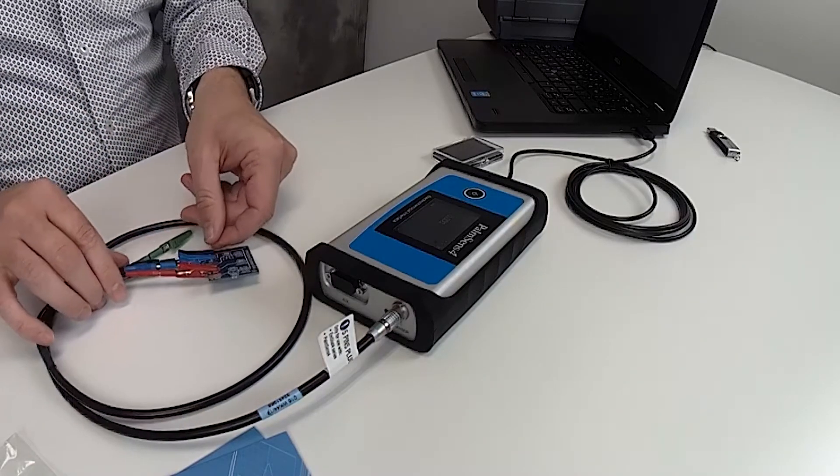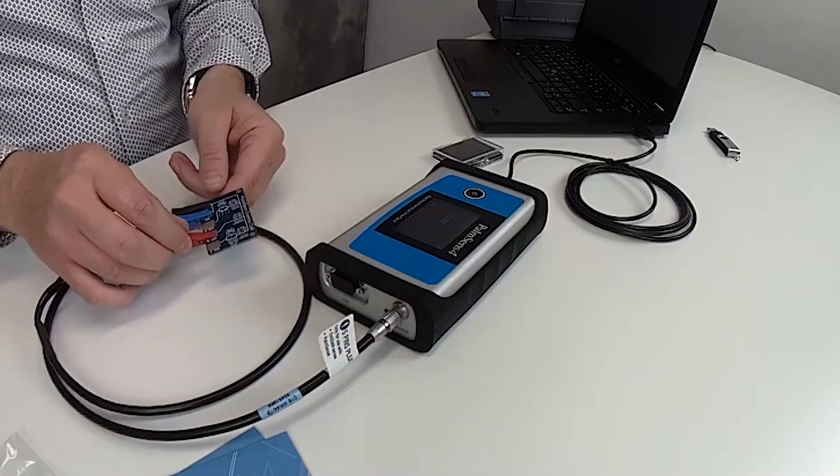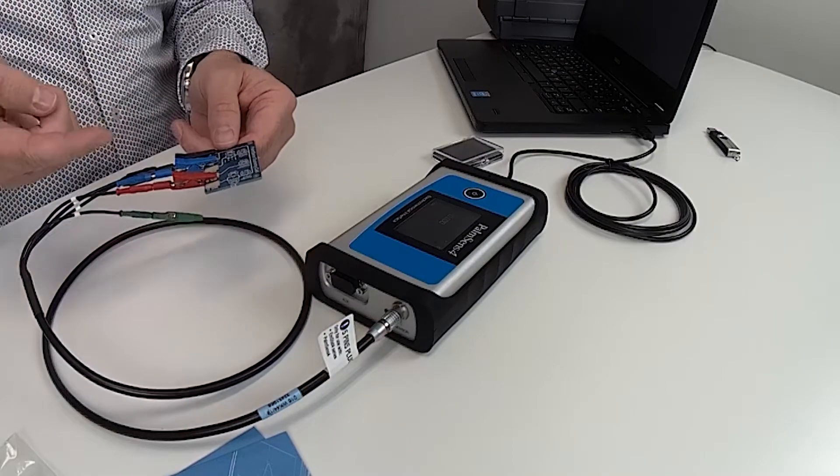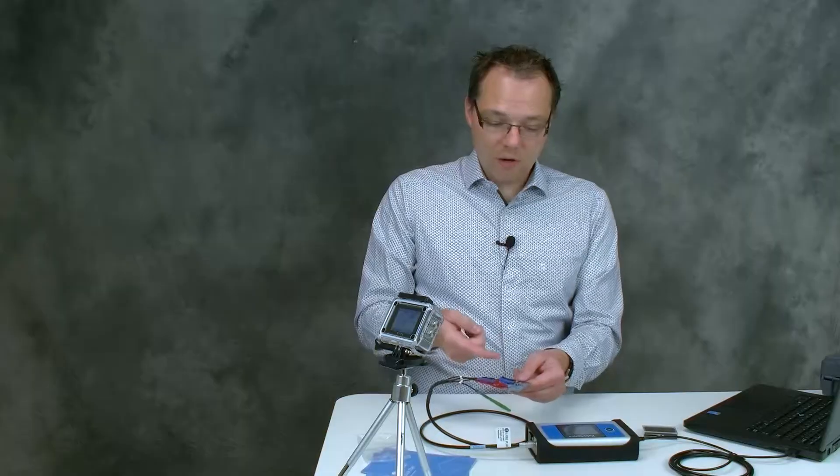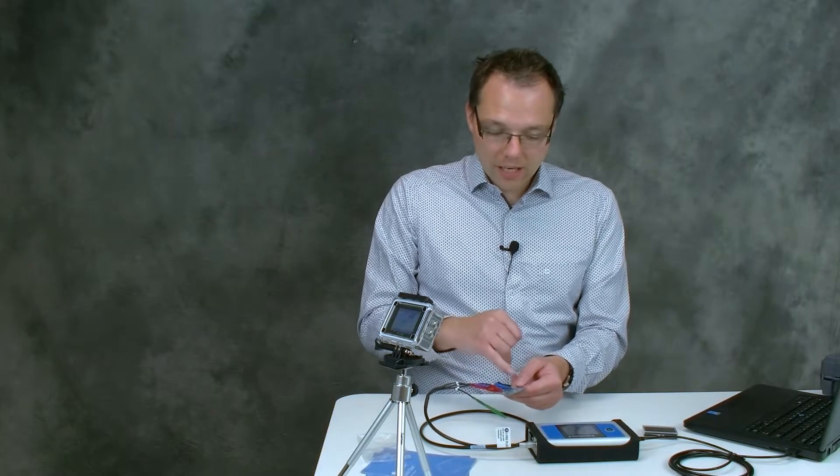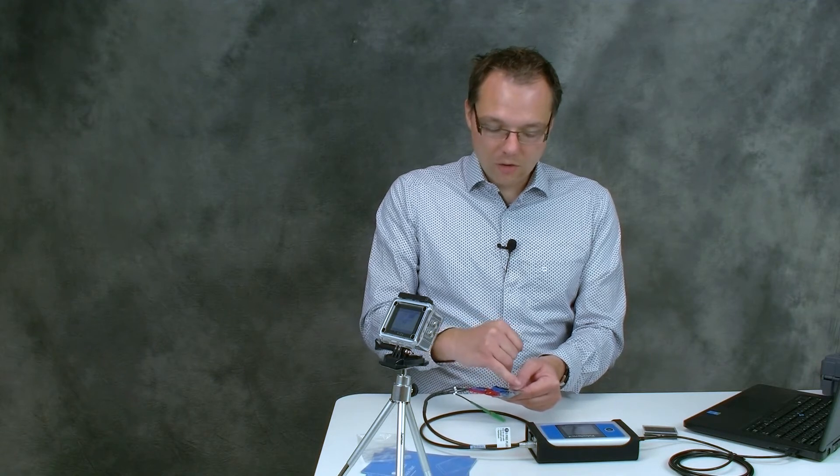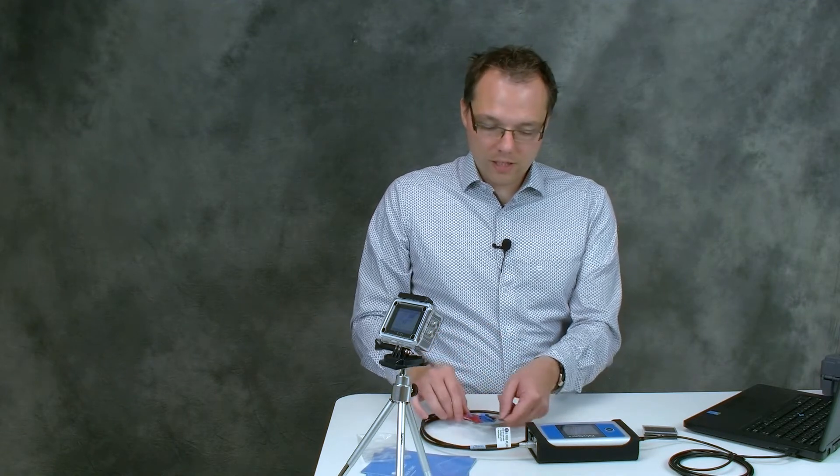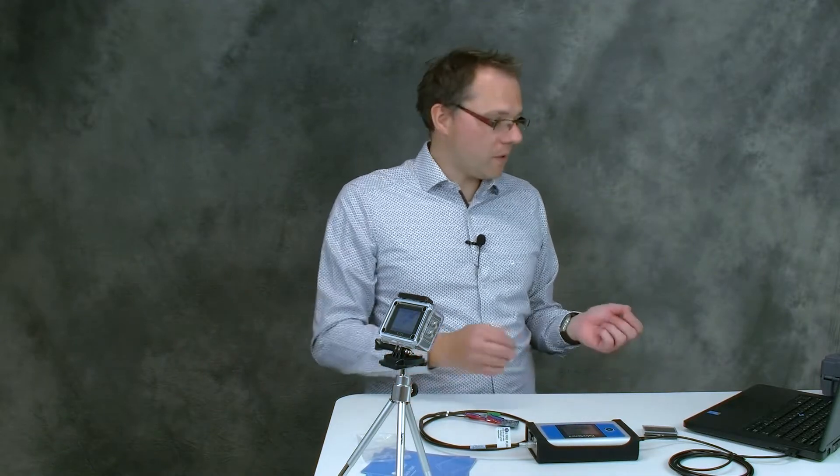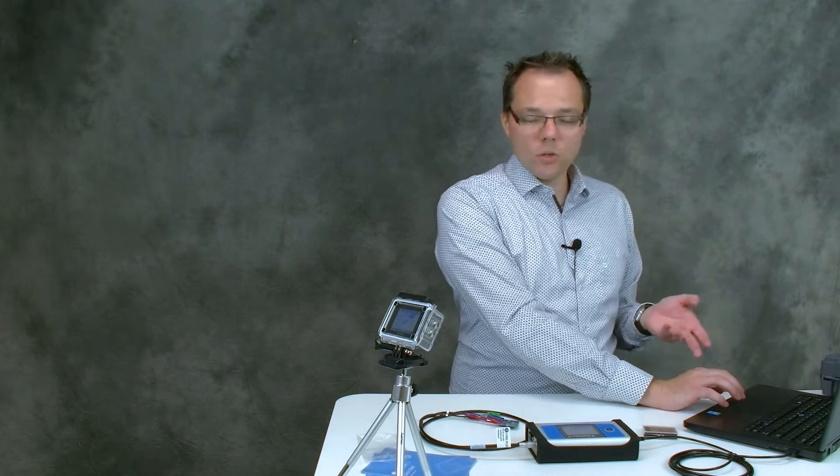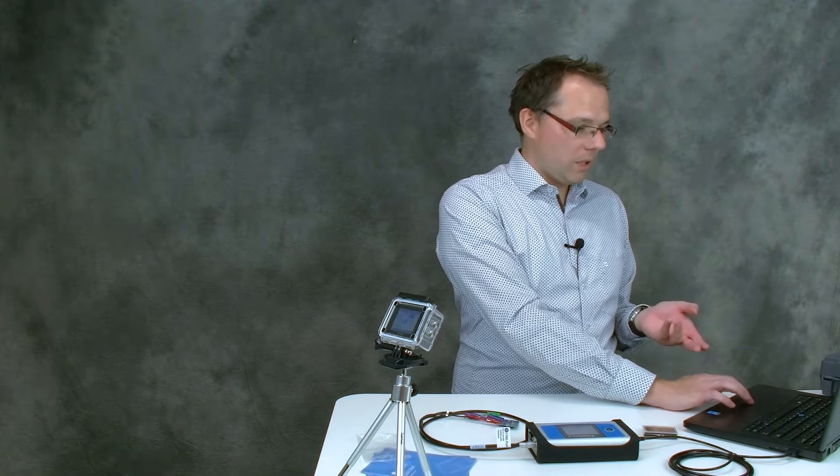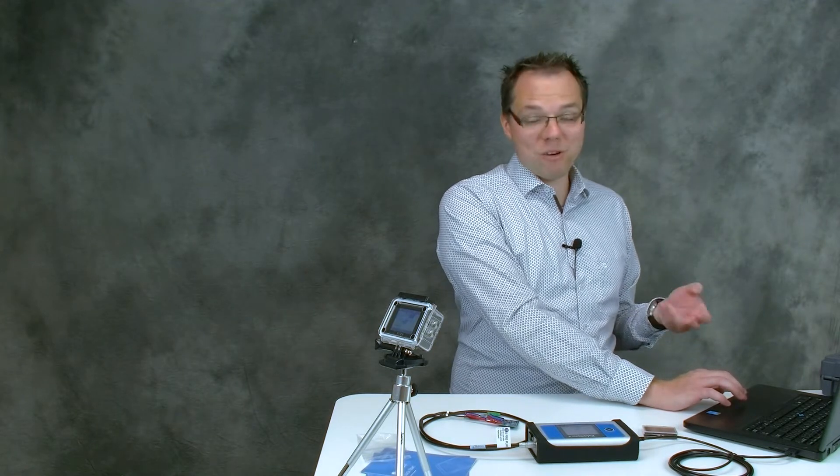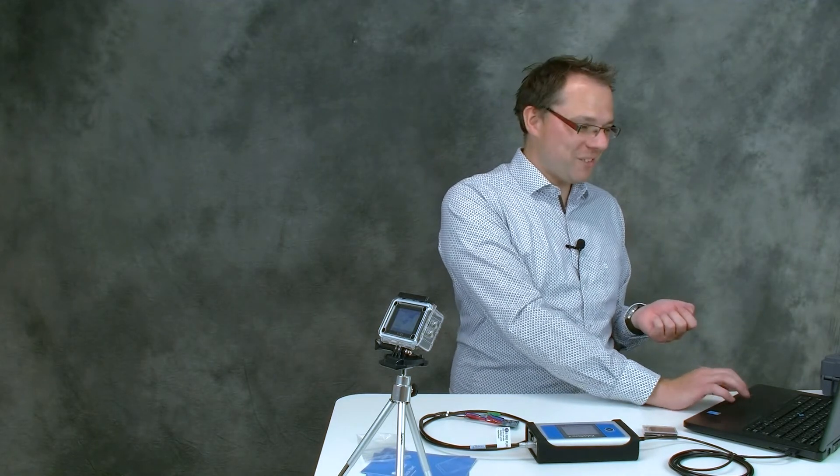OK now our dummy cell is connected and if you want to know what is the circuit that you now have connected on the dummy cell you actually can just read it on the drawings on the dummy cell. OK now we're going to do our first measurement. For that either you have already started PS Trace or now you need to open it to use your potentiostat.